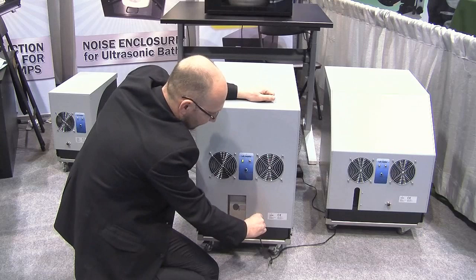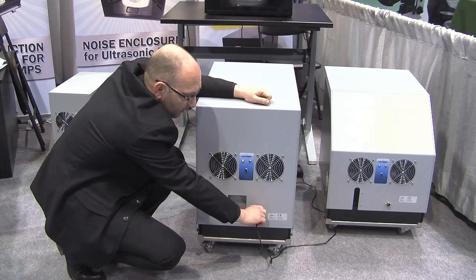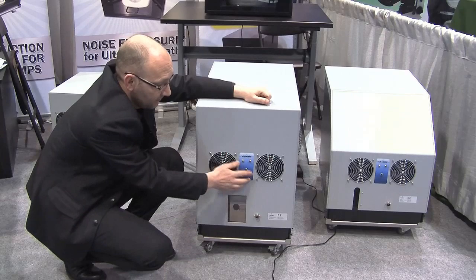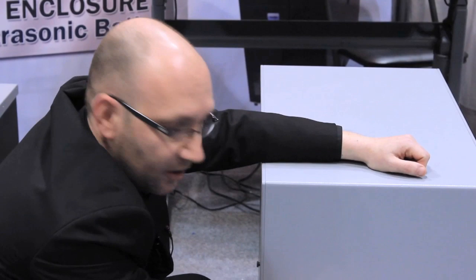If you have an issue — for example, an obstruction here or here, or even if the main power supply is disconnected — you have an overheating alarm here. Please note that the overheating alarm is still running even if the main power supply is disconnected, so it will alert the customer there is an issue inside the enclosure.